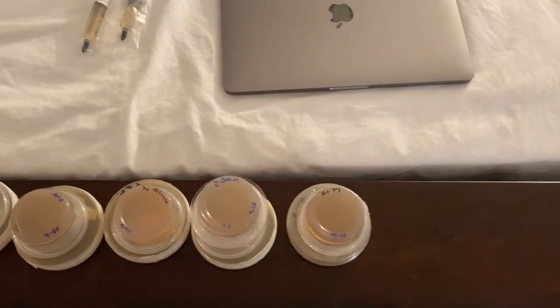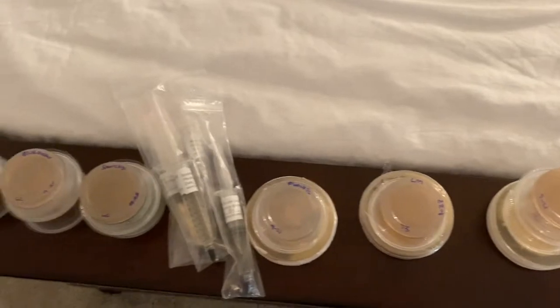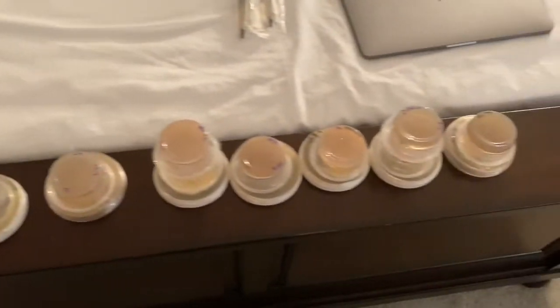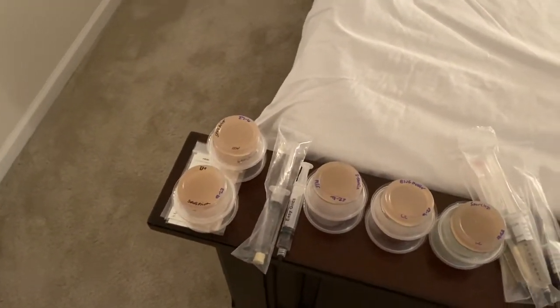So whenever I'm planning on doing agar work, I like to line everything up, mainly because I have OCD, but also because it helps with fewer contaminants. Because if you do your cleanest work first and then your dirtiest work last, you're not going to be dealing with your mess from the work before.